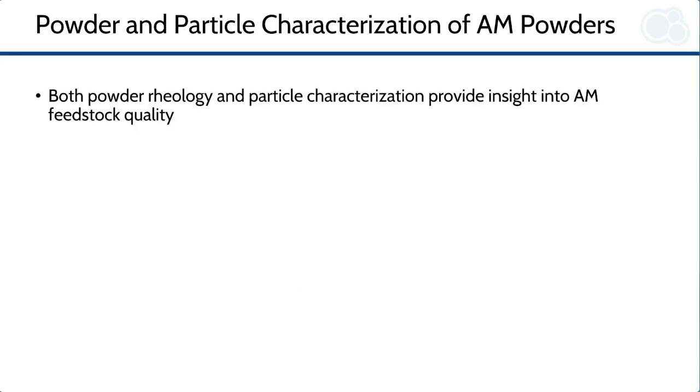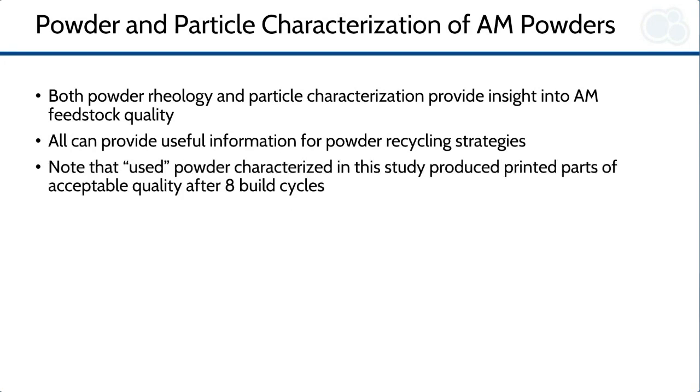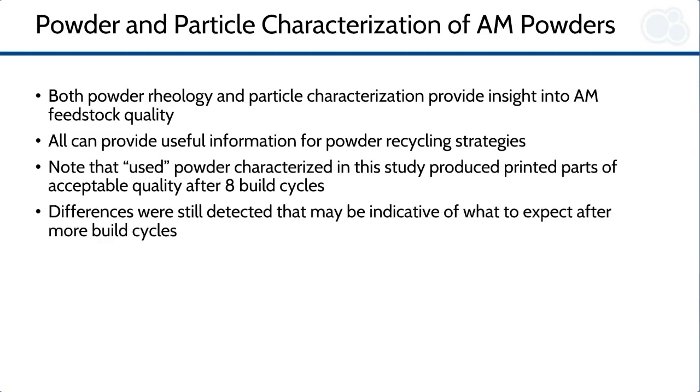In short, both powder rheology and particle characterization provide insight into the quality of AM powdered feedstocks. All of these characteristics can assist with feedstock recycling strategies. Parts of acceptable quality were produced using all the powders investigated in the study, even after 8 printing cycles. The differences seen here may indicate what to expect with feedstock powders after more printing cycles.